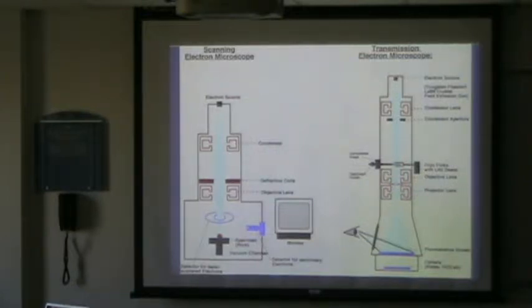But then the key difference in a scanning electron microscope is you use a lens not to make an image. So the lens is not an imaging lens in that sense, like you have it in another microscope. The only thing the lens is really doing is it focuses the beam on a very tiny spot, and then you have deflection coils which scan the object up and down. And for each scanning increment, you measure a couple of events, for instance, secondary electrons or backscattered electrons or all kinds of stuff. So you don't really make an image with the lens itself, okay?